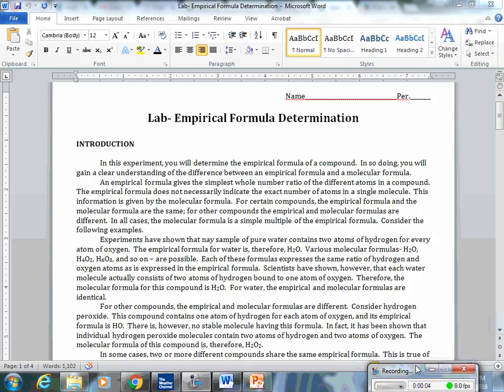Greetings. This is the pre-lab video for the Empirical Formula Determination Lab. In this experiment, you will determine the empirical formula of a compound.